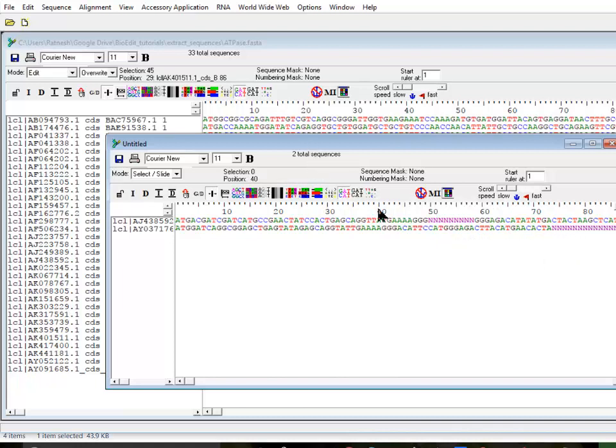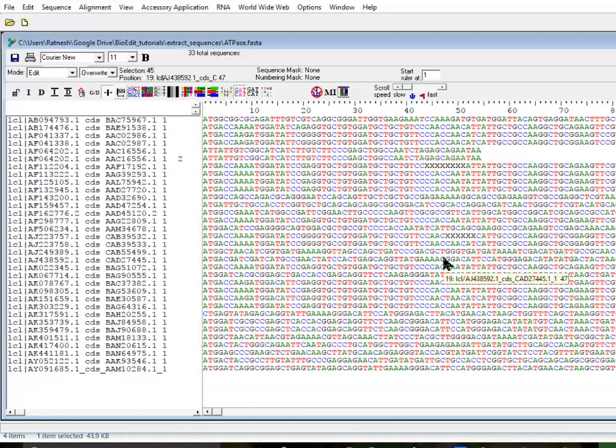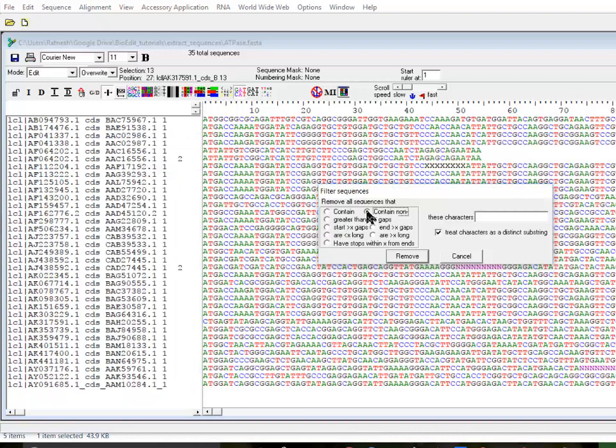That's the option I chose to extract and save them into a new alignment. You can save this file as a new file. I'm not going to save this one and then I'm going to undo.